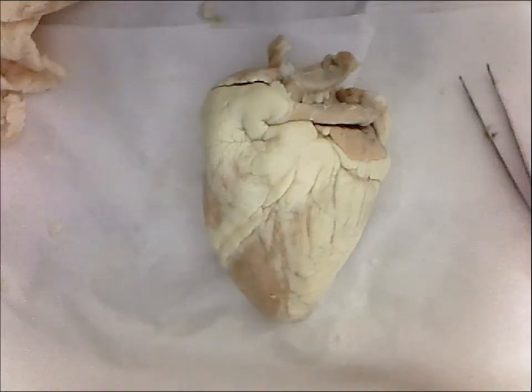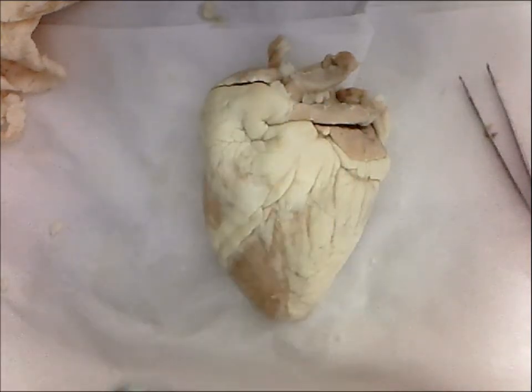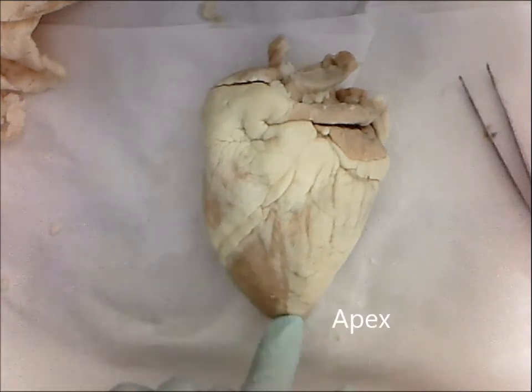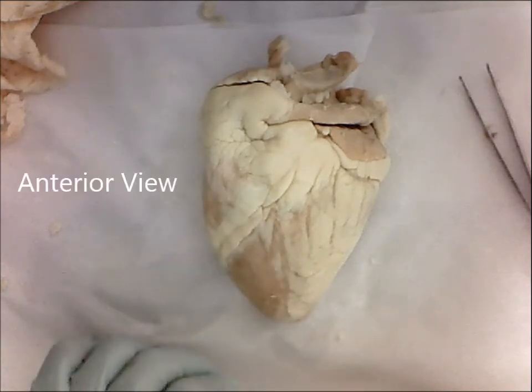Once you've removed the pericardial sac from the heart and you have carefully removed some excess adipose tissue from around the blood vessels, the next thing you have to do is orient this heart. The apex of the heart points inferiorly. The base points superiorly. I'm looking at an anterior view of the heart.